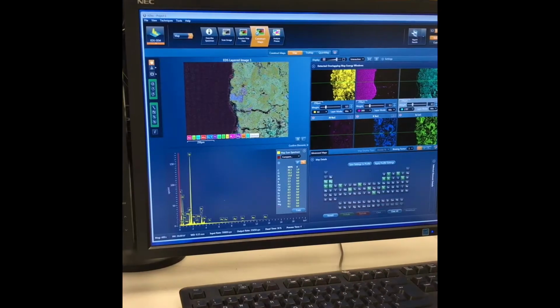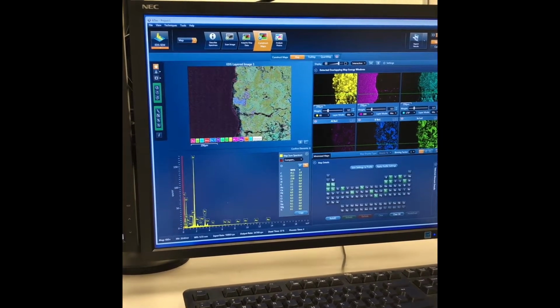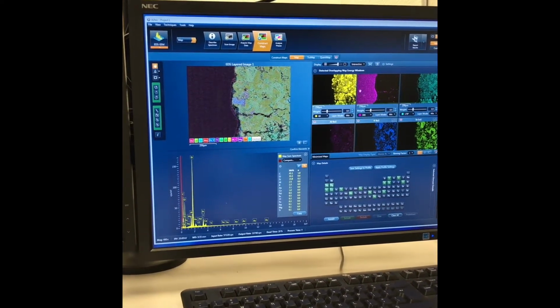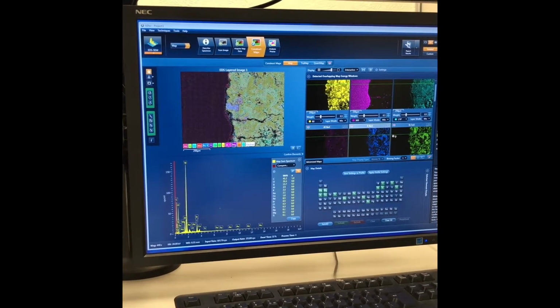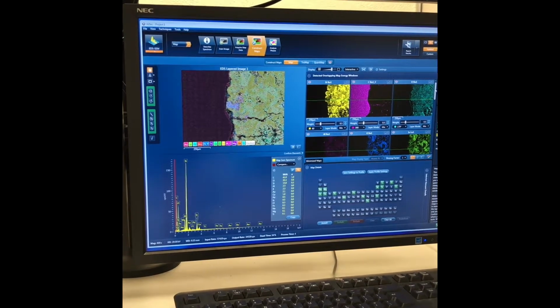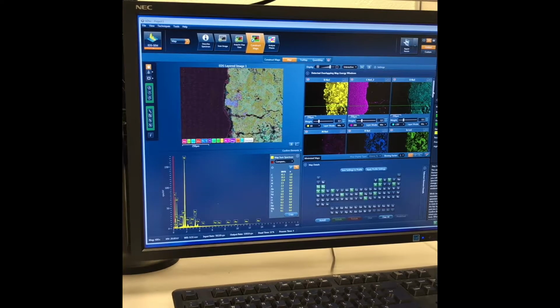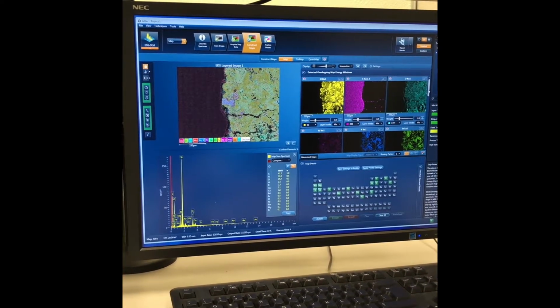So now that you all are in my pocket, we will talk about some of the key features of our mapping software here on the Oxford EDS detector. And really, I'm hoping to imbue upon all of you that we need to take a map of every kind of sample that you all have as just your default thing to do as soon as you put it into the SEM: new EDS data.